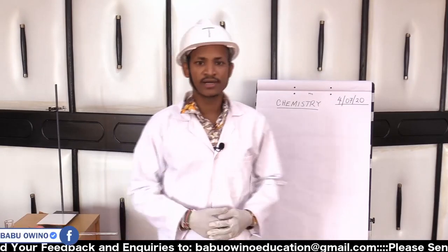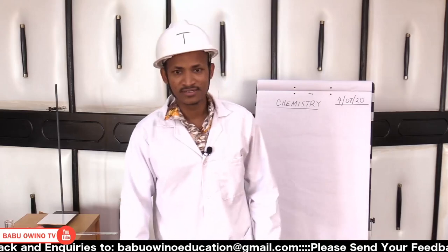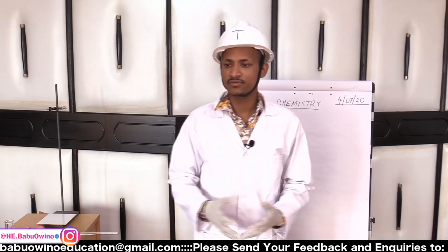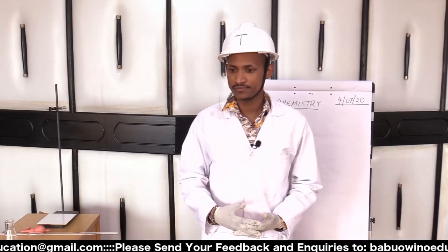Today's lesson is on chemistry practicals. That's why you can see how I've decided to dress. Chemistry practicals involve use of different reagents, basically solutions. So we will work on titration.